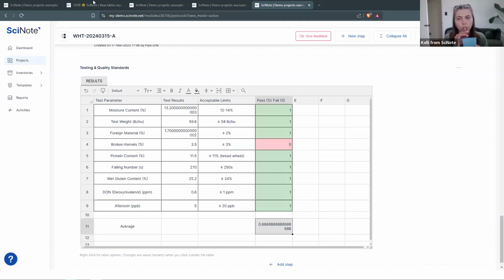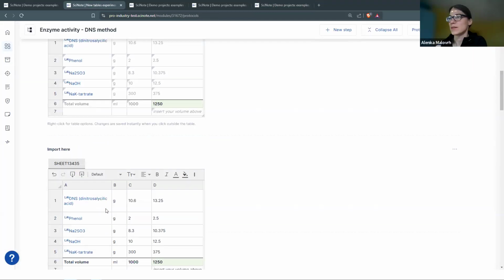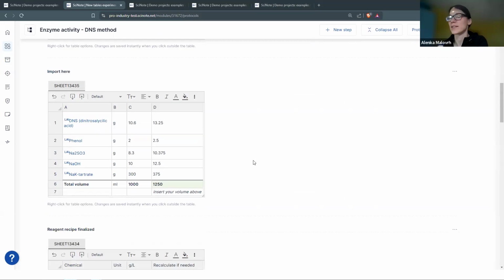Let me jump back. So it was the imported one. Yeah, that is correct. I will double check that afterwards, because I can admit that I actually didn't notice that before. I think this is because the top row probably was not exported properly.